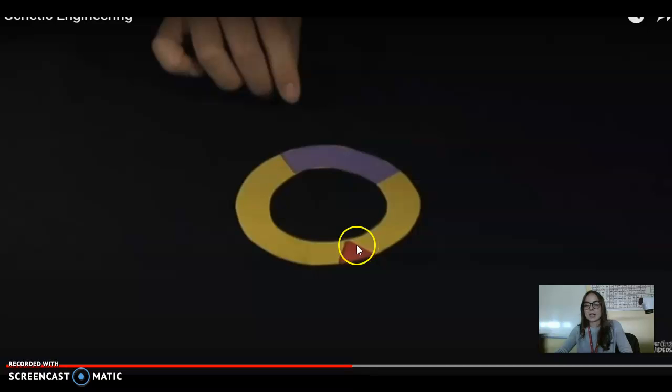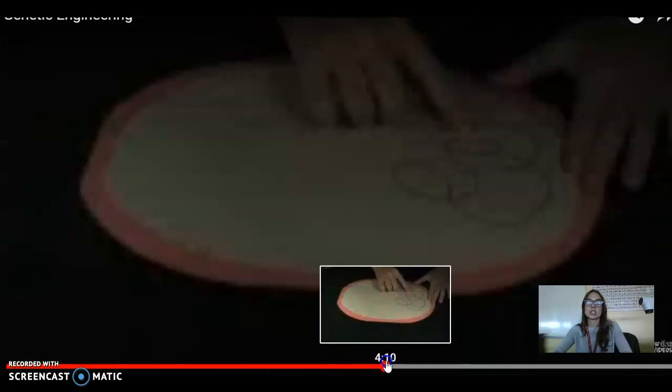Well, that brings us back to that red triangle that I said we will revisit. So all of these plasmids are going to be a little bit different, or have different options. Some of them could take up my good gene that I want. Some of them could take up random DNA. Some of them can close back up on themselves. But they all have this already. I picked a specific plasmid that has this, and it's a gene that codes for antibiotic resistance. So all of these plasmids will produce a protein that allows those bacteria to be resistant to the antibiotic. And that means that those ones that took up any of those are going to live.